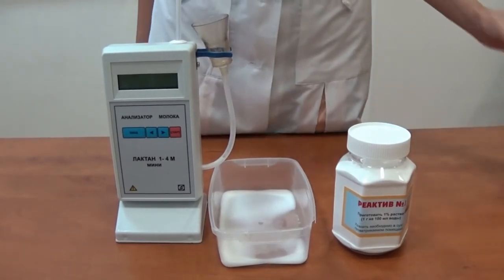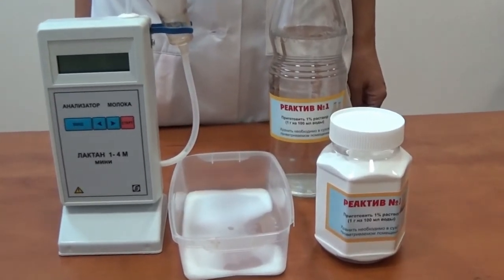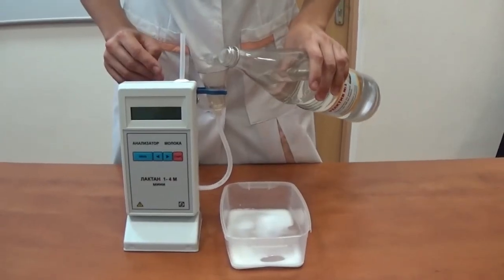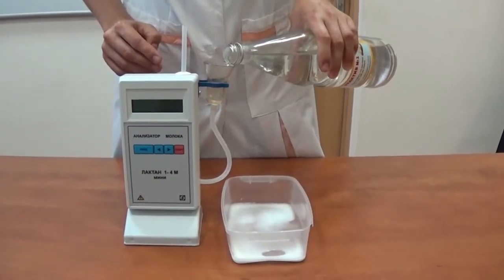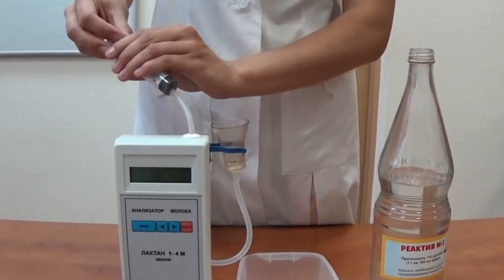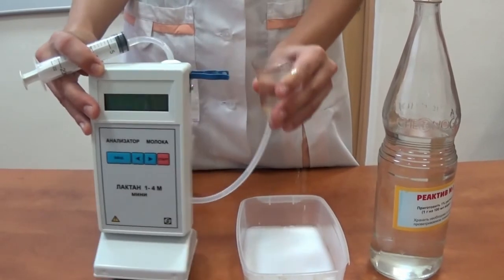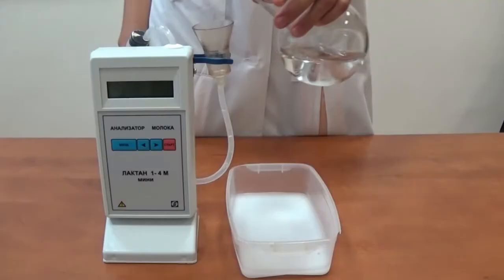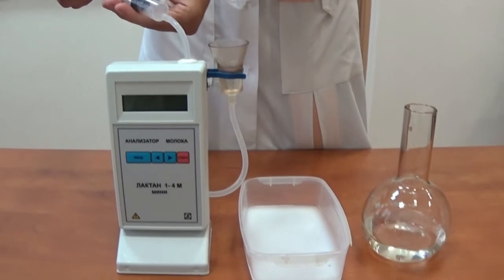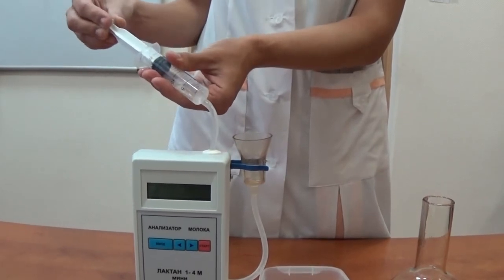Disconnect the power cable from the power supply. Preheat clean tap water to 50–60 degrees centigrade and mix the cleaning reagent number one in proportion of half a gram (one teaspoonful) to 100 ml of water. Pour the cleaning liquid into the sample receiver. Connect the syringe for cleaning to the connecting pipe and make several pumpings with the syringe. Change the cleaning liquid and repeat the procedure. Then change the cleaning liquid to clean tap water and clean once again, changing the water until it becomes clean.